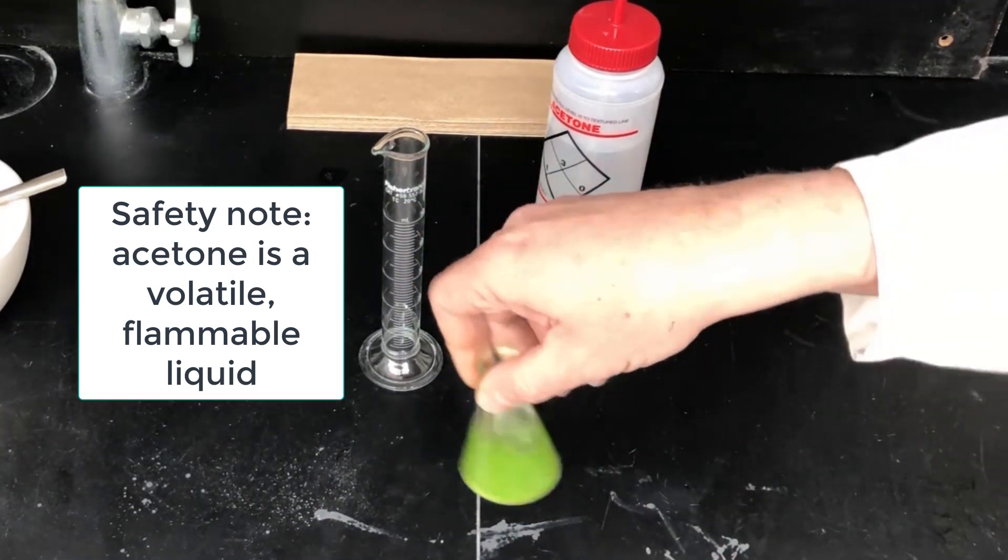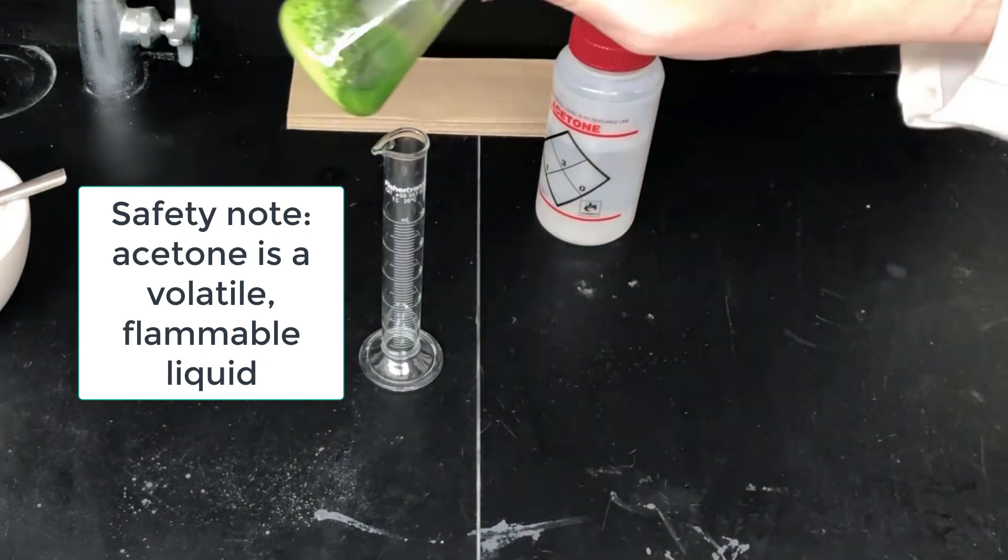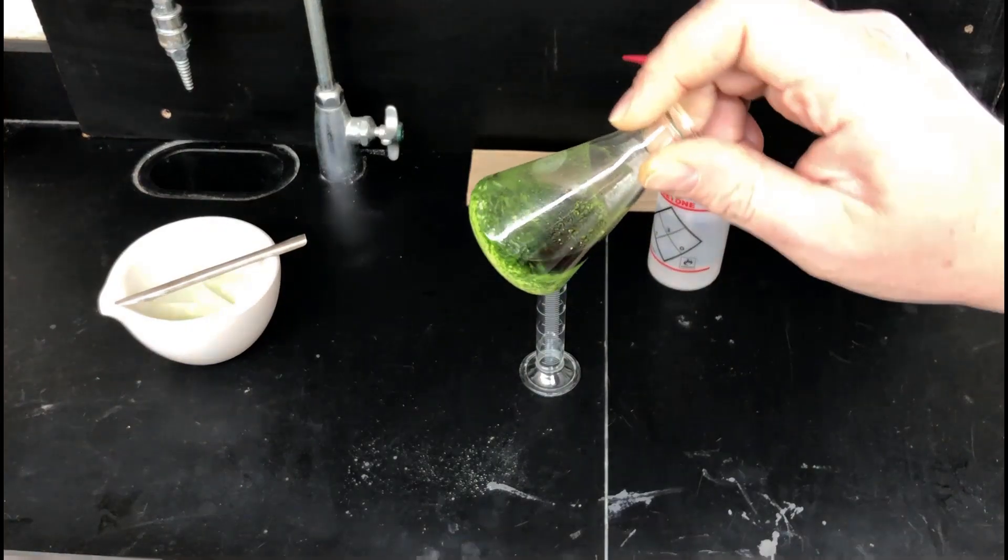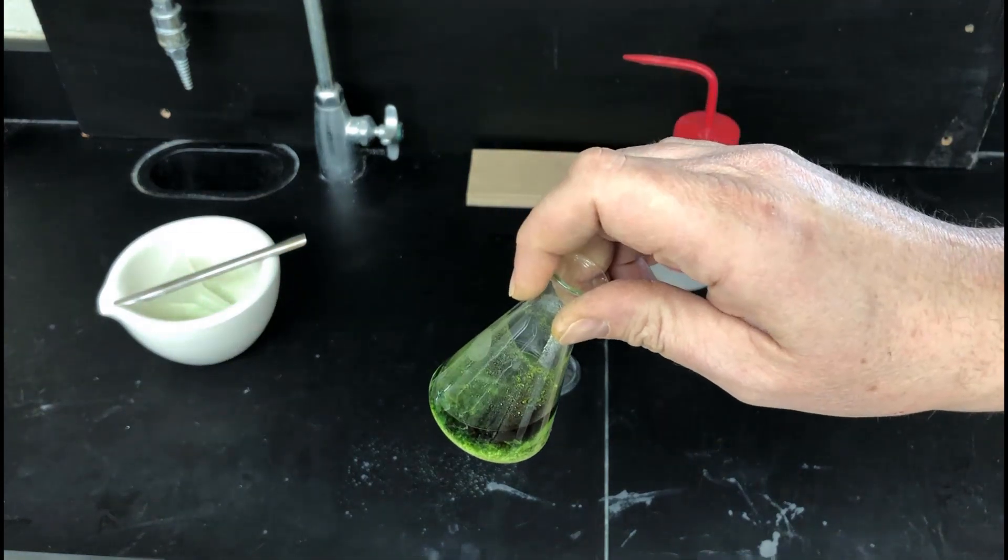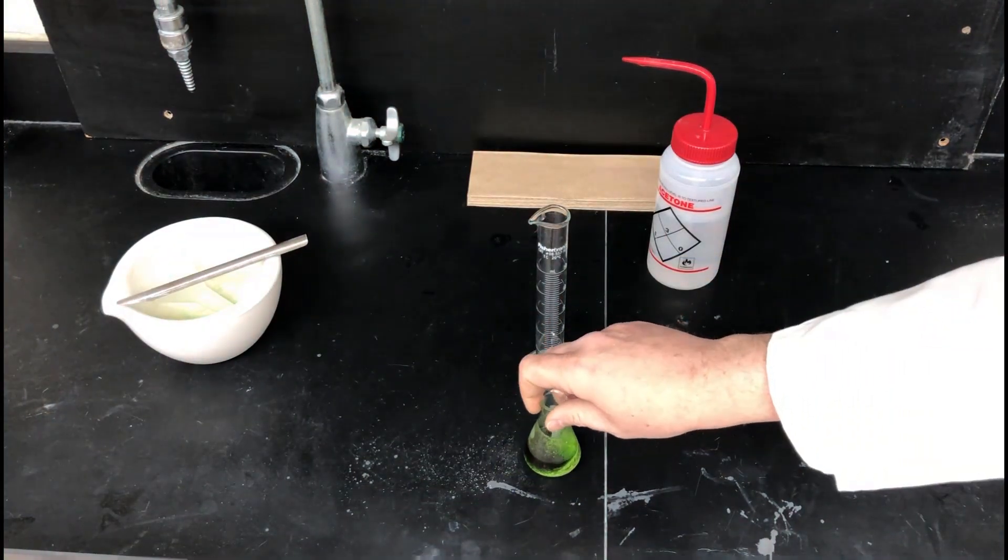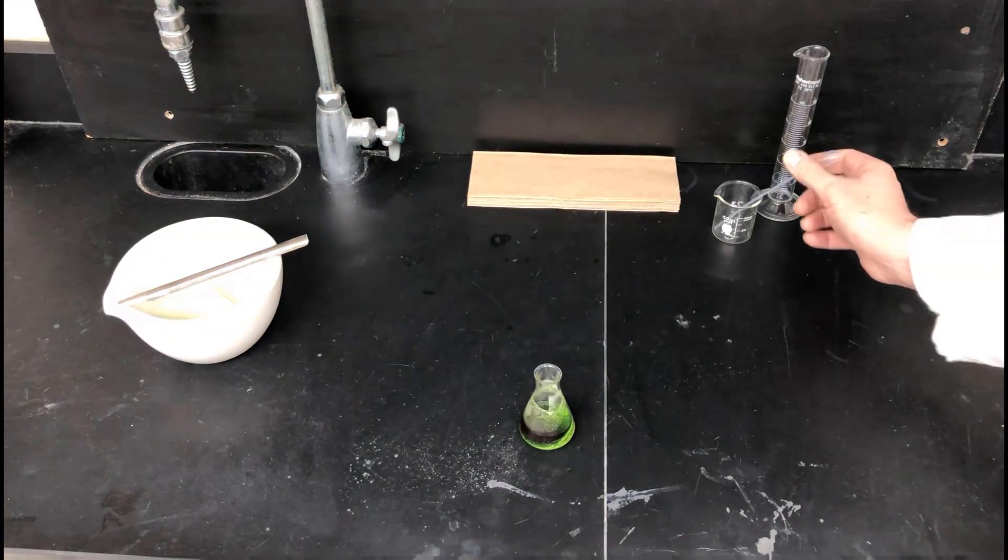So now there's this acetone solution that's swirling around in there. And if you swirl it around, stop it for a bit, you'll see a dark green liquid above the solid. That's the pigment solution that we want.